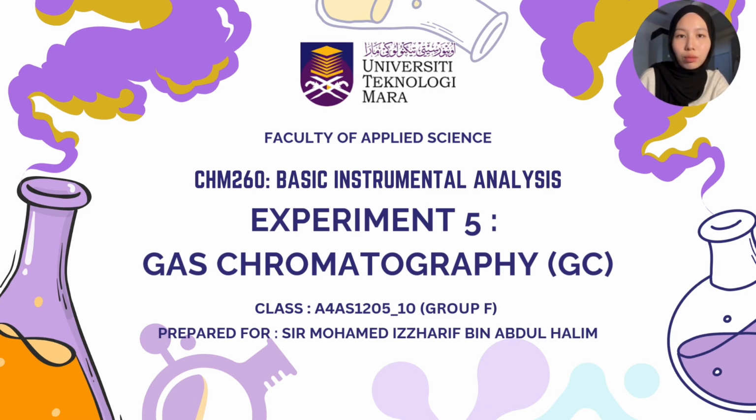Today we are excited to present our findings for experiment 5, gas chromatography, or more commonly known as GC. This experiment is a core part of our CHM260 Basic Instrumental Analysis course, where we explore the powerful technique used to separate and analyze volatile compounds.